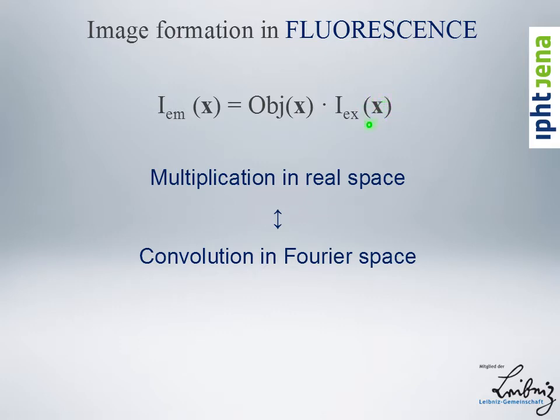So it is useful to now look at this very same equation in Fourier space. This might sound like, why would you do that? Because it's quite simple here, and in Fourier space it becomes complicated. However, because imaging itself is easily described in Fourier space, it is worth going through the pain, as you will see. So in Fourier space, it looks like this.